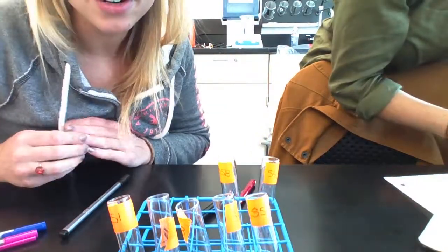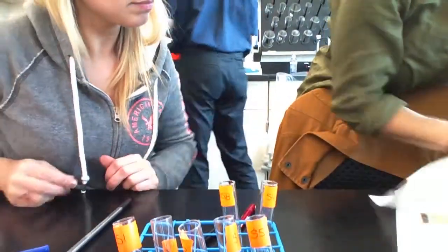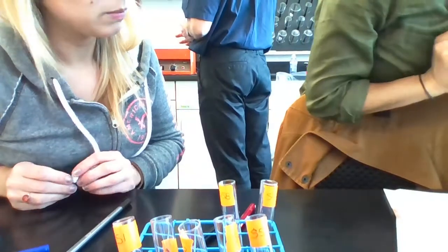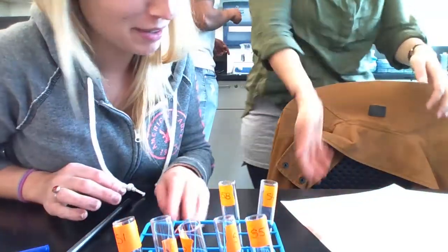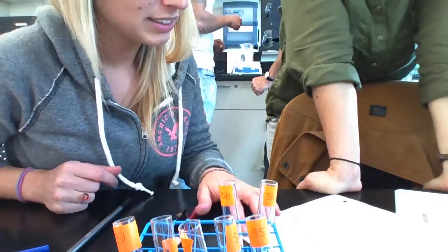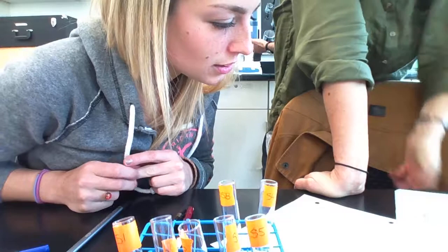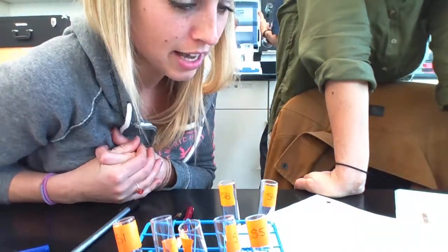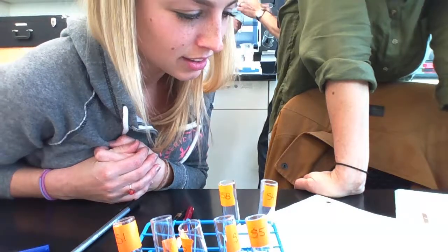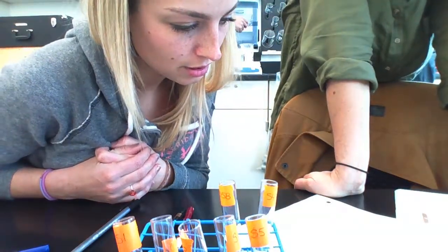This is page 600 in your lab manual, by the way. I can read about it really quick. Okay, starts on page 599. So we're assessing pancreatic lipase digestion of fat and the action of bile.